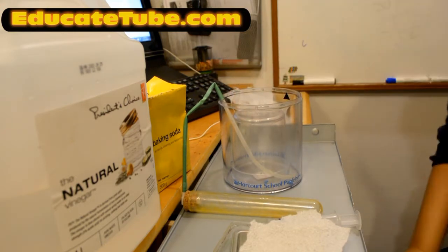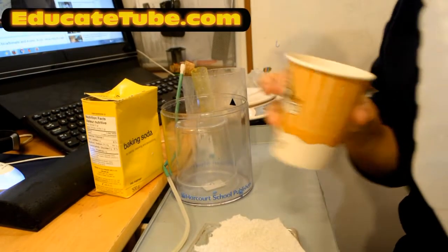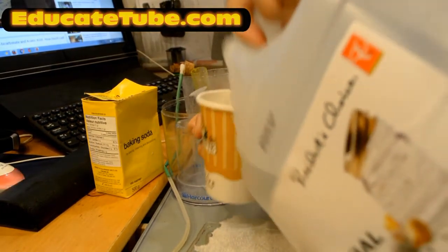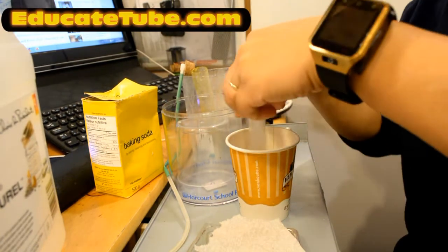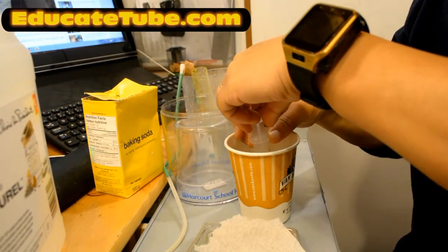I'm going to show you, and we're going to do the experiment. The first thing I'm going to do is take 20 mils of acetic acid. Here's a syringe. Take 20 ml. Oops.